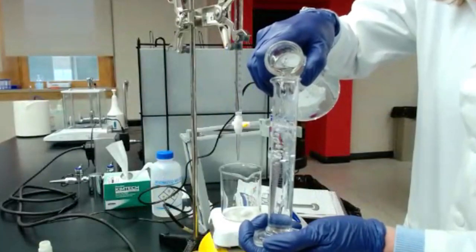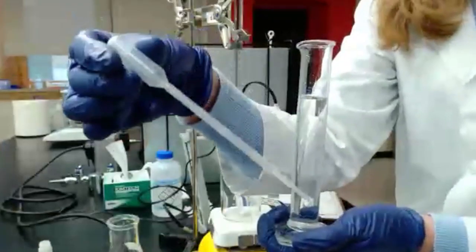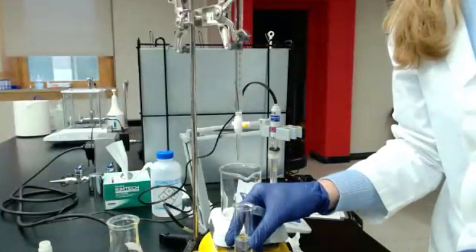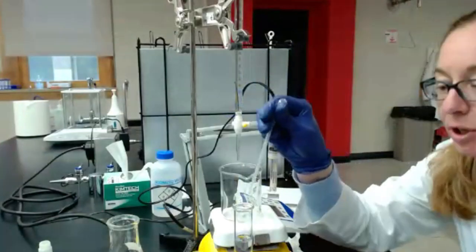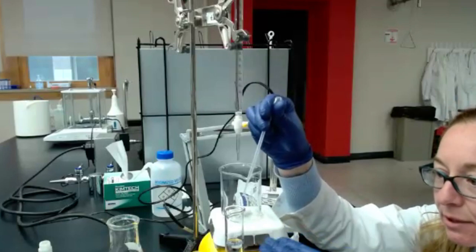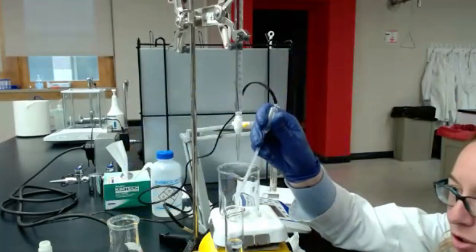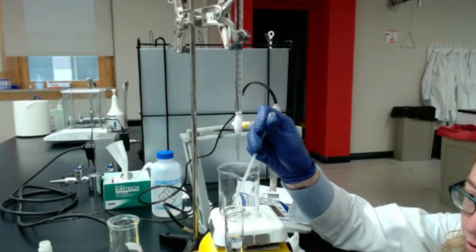To make sure I have the correct volume, I can use a transfer pipette to evaluate how much I should remove or how much I should add. With the pipette, I put myself in front, my eyes in front of the meniscus, and I still need to add more. So I'm gonna use the pipette to make sure I reach up to the line of 50, or 100 if you have 100.